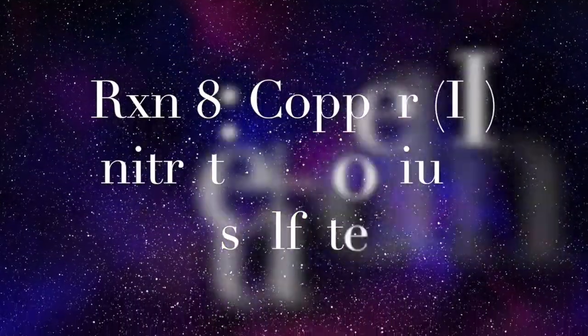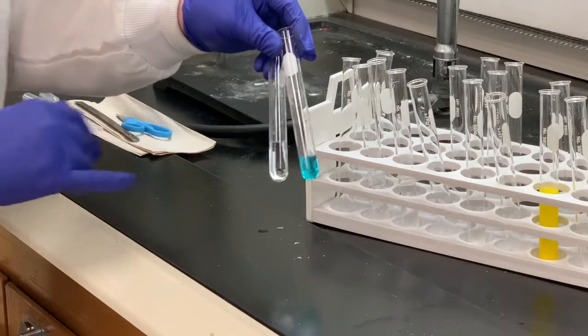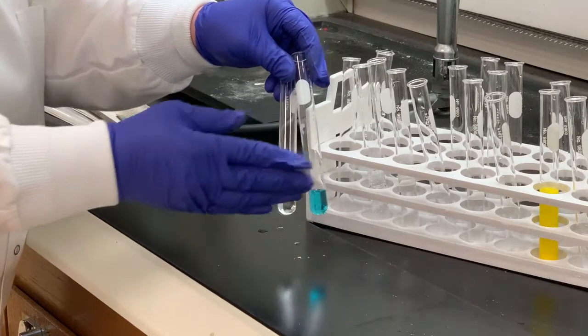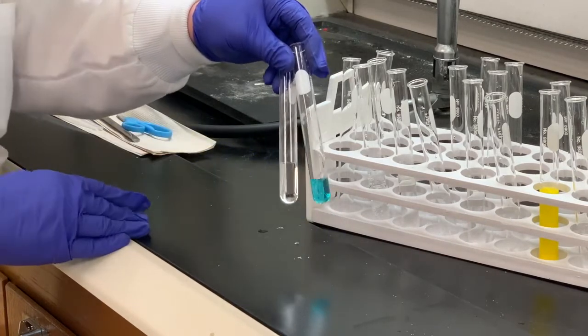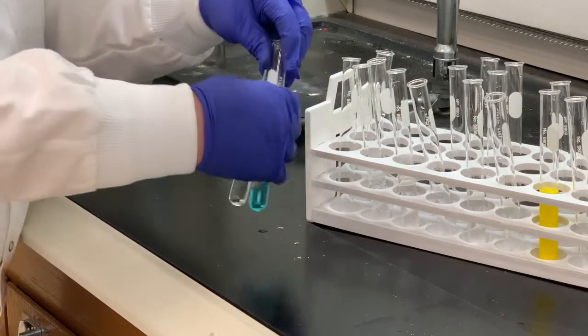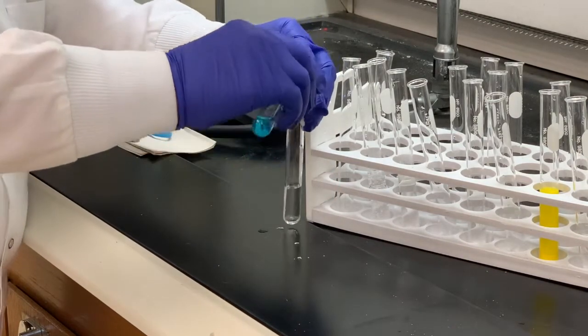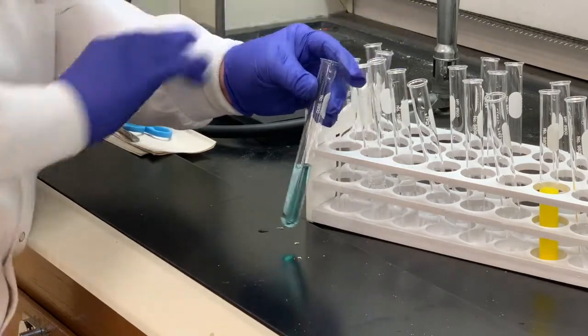Set of reagents is copper 2 nitrate with sodium sulfate. Notice most of the solutions are colorless. We had a little bit of color with the sodium iodide, but the copper 2 nitrate, we always have that characteristic blue color for copper plus 2 ions. So I'm going to add one to the other. So just a bubble or two on mixing.